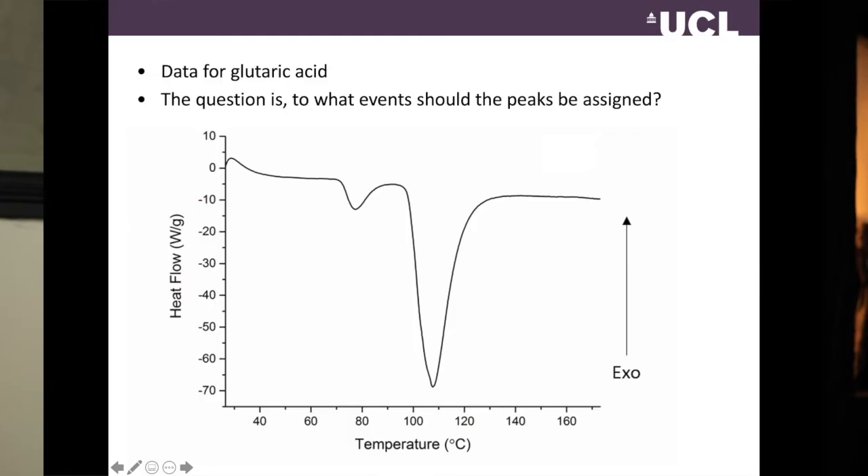On screen is another set of DSC data, in this case for glutaric acid. To a first approximation it looks pretty simple — there's a baseline period, then around 75°C there's what looks like a melt (an endotherm), and then around 100°C there's a second event. But the question is: what events should we assign these peaks to? We started with glutaric acid — why are there two peaks in what should otherwise be a pure sample? We didn't know what to do with this data.